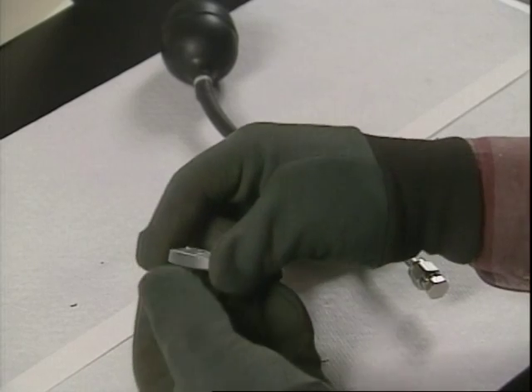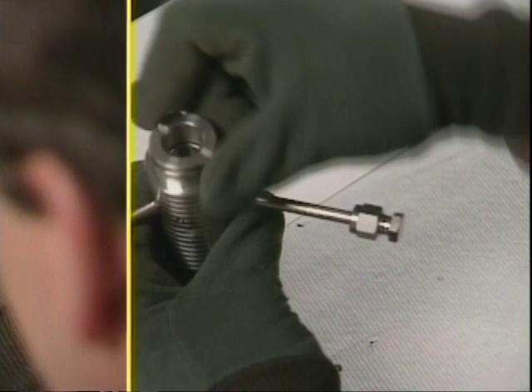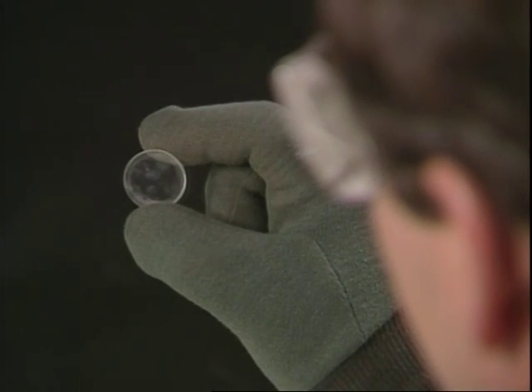Now, remove the window gaskets. Dismantle the other end of the cell in the same manner. Inspect the windows for chips, cracks, and etching.